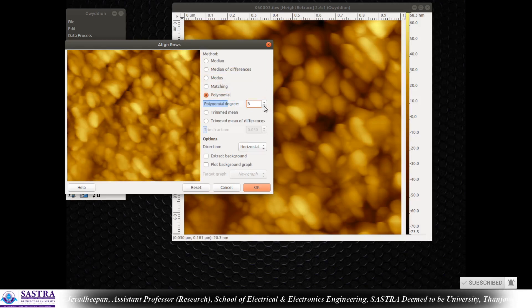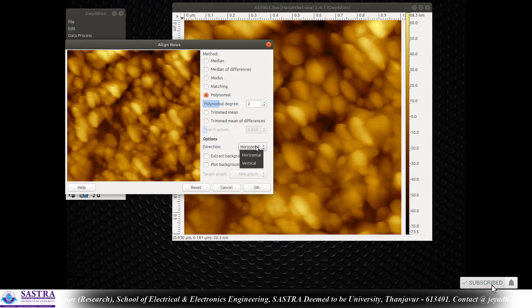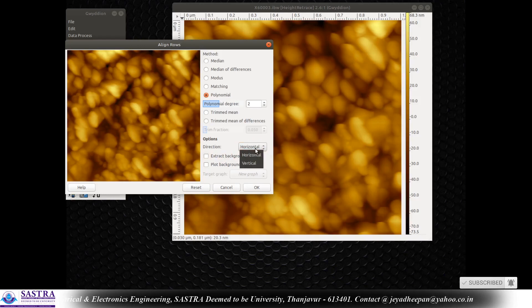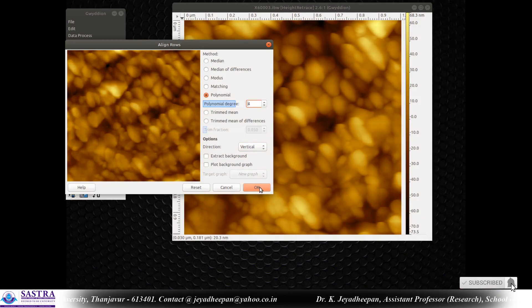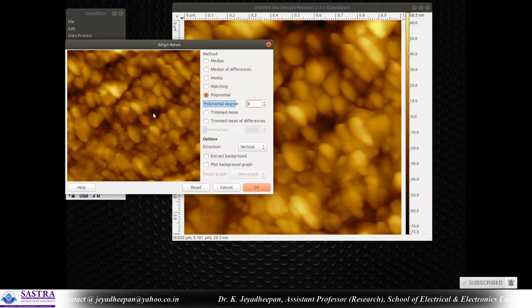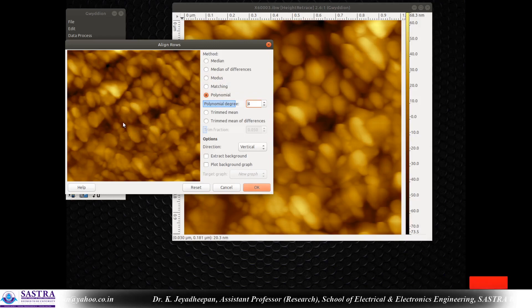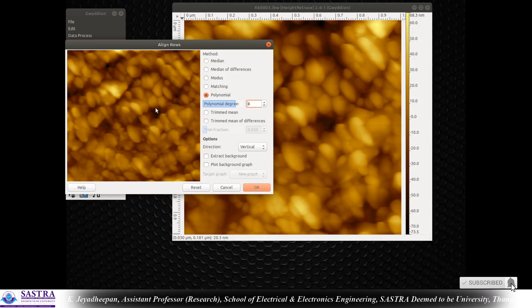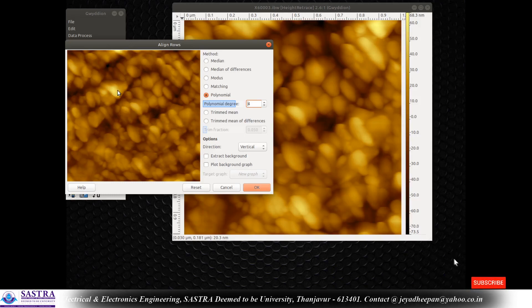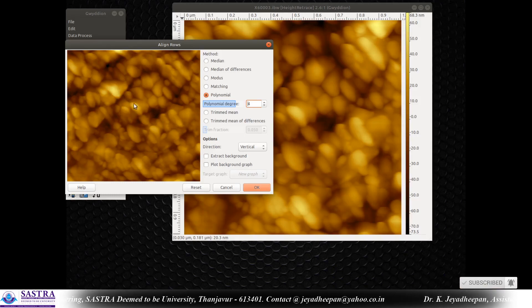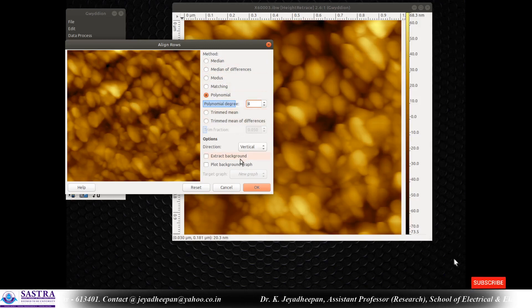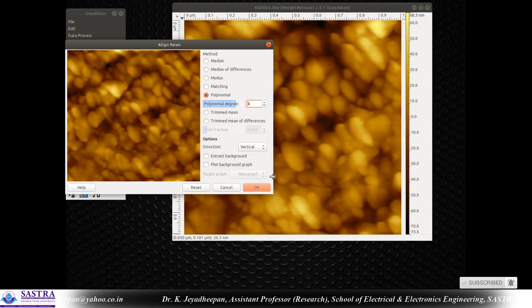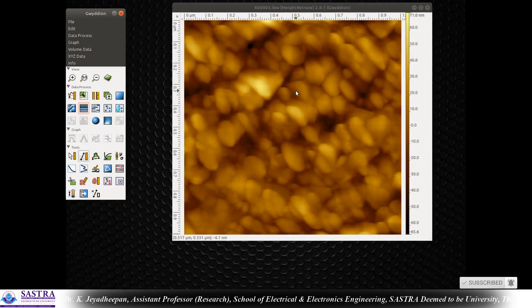You can increase or decrease the polynomial order. After doing the correction for horizontal, you have to do it for vertical as well. After applying the polynomial correction for the background, you will see the exact background will be dark in color and the peaks will be in high contrast color. After selecting the method and settings, press OK.